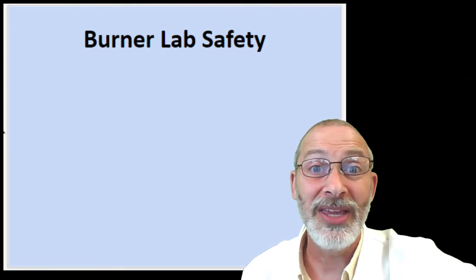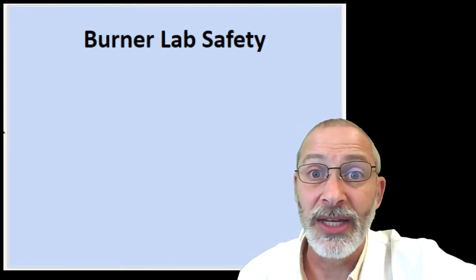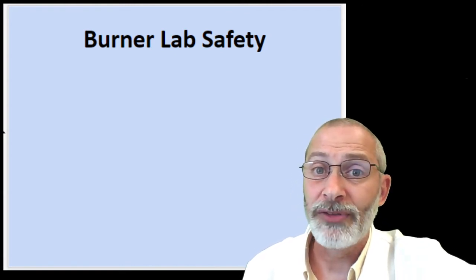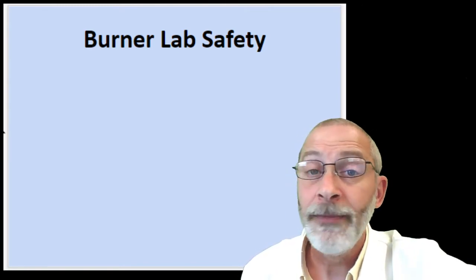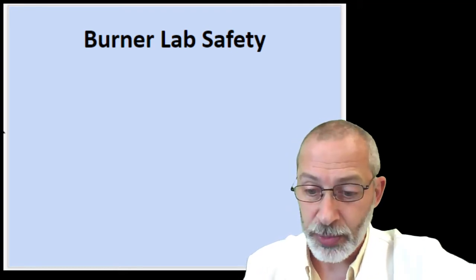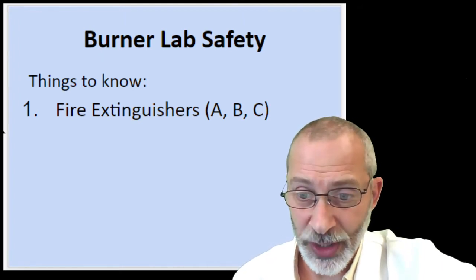This topic is the topic where we have to make reference to these things. I need to point them out to you in case we would ever have to use them. My hope is that we will never have to use these things, but if we did, you need to be aware of them first. So let's begin with probably the most obvious thing, fire extinguishers.